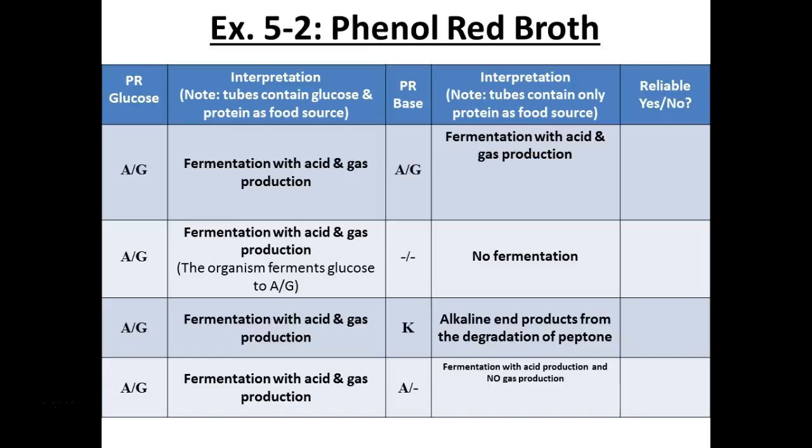Is that possible? No, somebody screwed up, right? Somebody contaminated your tube with some sugar or something. I don't know, right? We would not trust this. Does everyone understand why we would not trust that? Right? This is a protein-only tube. How the heck did we get fermentation of a sugar? Somebody goofed.